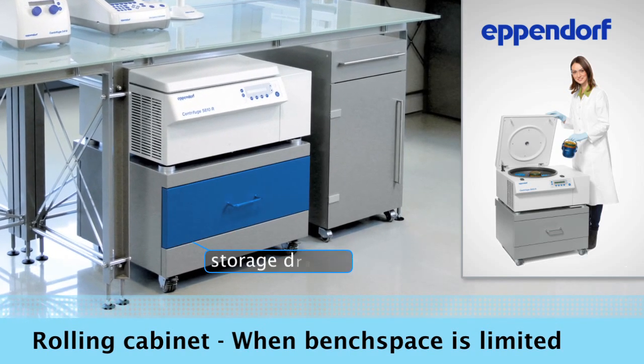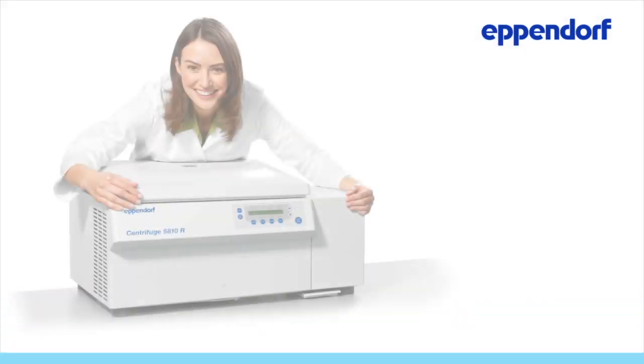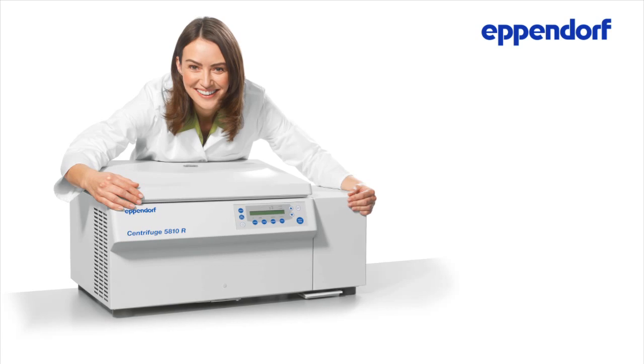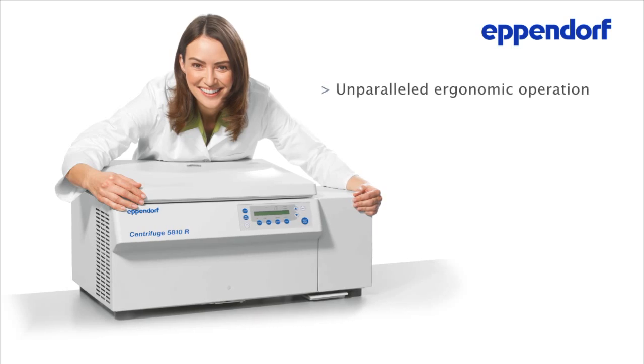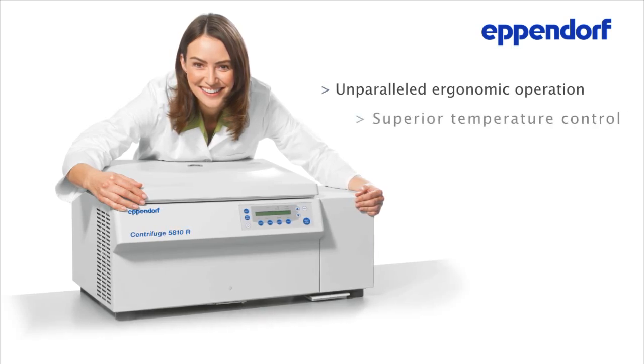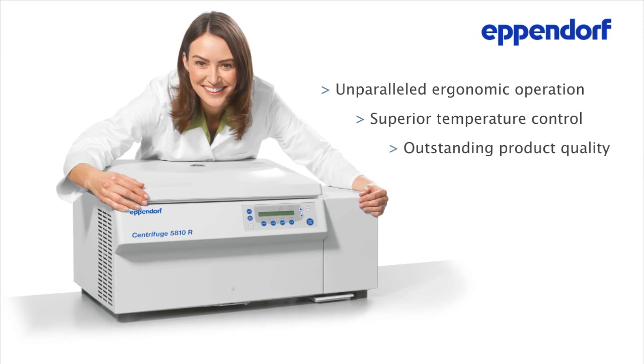The included drawer provides extra storage for your rotors and adapters. Eppendorf centrifuges provide you a safe and cost-efficient solution for your lab. They go beyond speed and capacity to offer you unparalleled ergonomic operation, superior temperature control, and outstanding product quality.